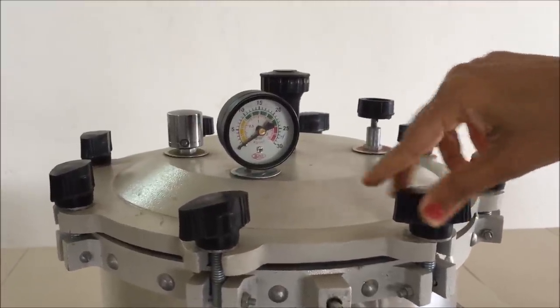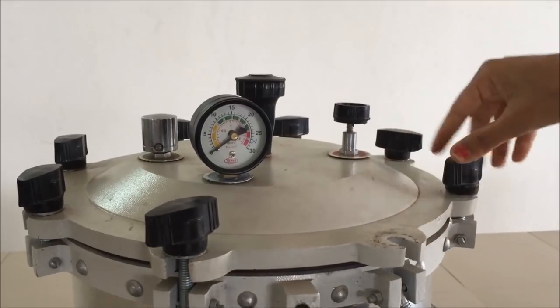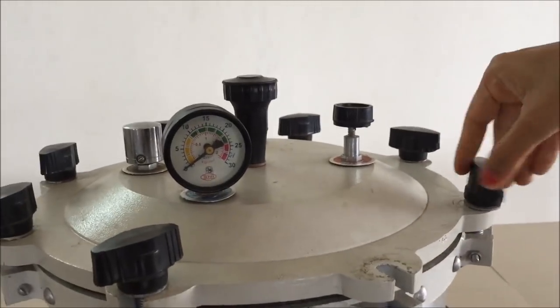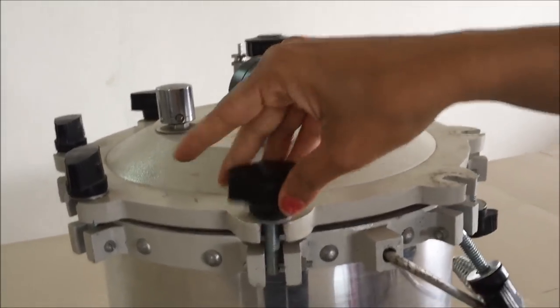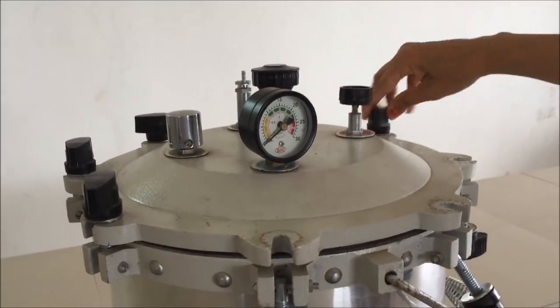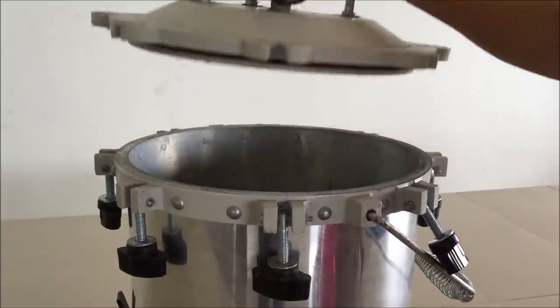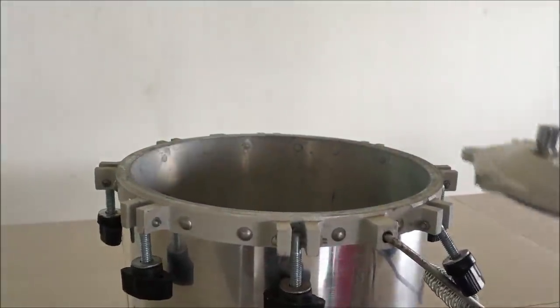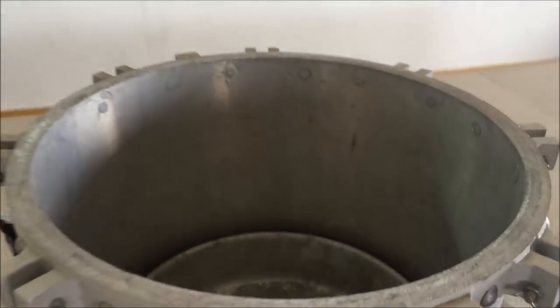Autoclave also having several pairs of nuts which are used to tie its body to the lid of autoclave. In between the top body and bottom body there is a rubber gasket or rubber valve which creates a vacuum and allows the pressure to stay inside the autoclave.